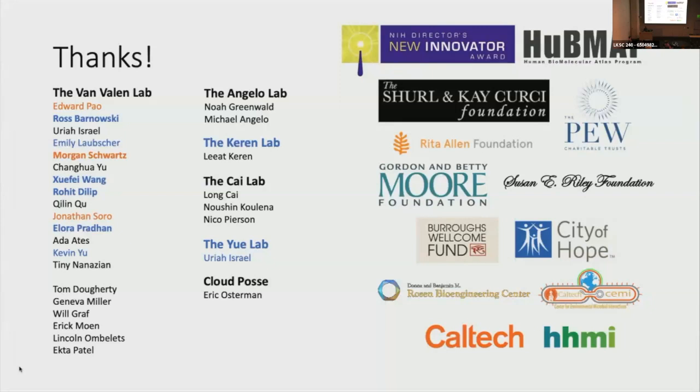And it's not like there aren't good reasons for advocating for different specialist models. One is that people have different data sets, and it's challenging, as we've experienced, pulling everything together and integrating it into the same database. The second is that a lot of this imaging is done as two-dimensional cross sections through three-dimensional objects, so you actually do have a very real degeneracy in your solution space.